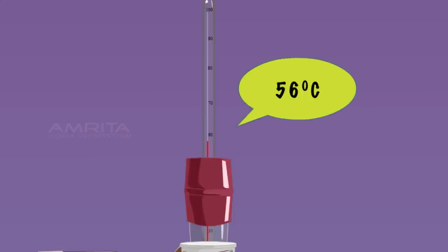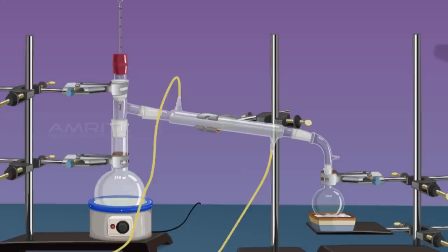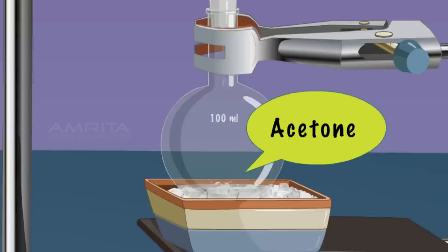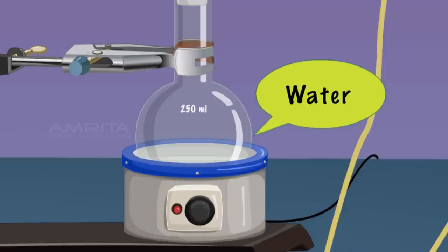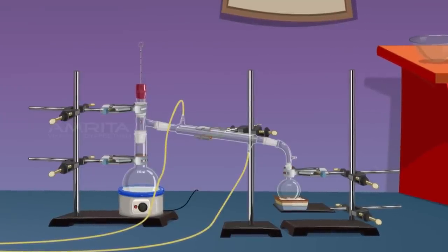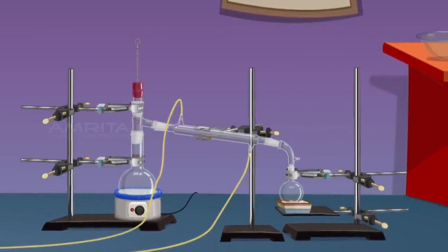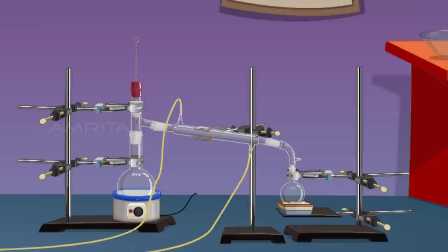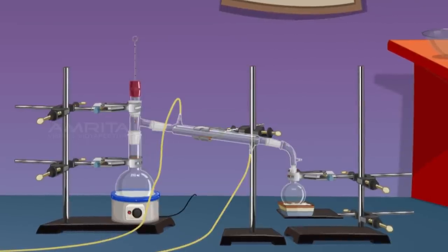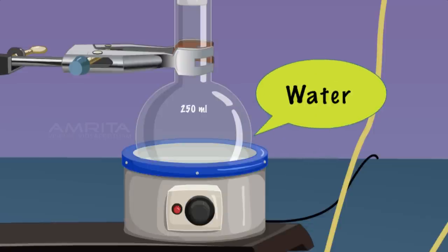At 56 degrees, acetone vaporises and the vapours pass through the condenser and condensation occurs. The acetone is collected in the receiver flask in liquid form. Water is left behind in the distillation flask. Simple distillation is used for the separation of a mixture containing two miscible liquids that boil without decomposition and have sufficient difference in their boiling points. Acetone boils at 56 degrees and water boils at 100 degrees.